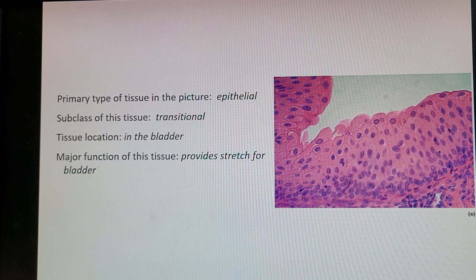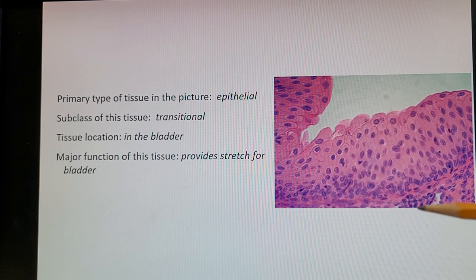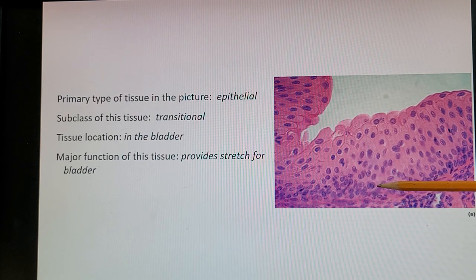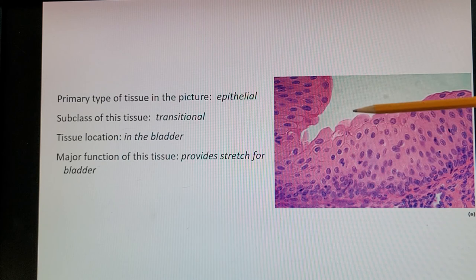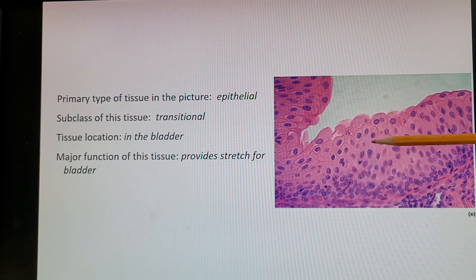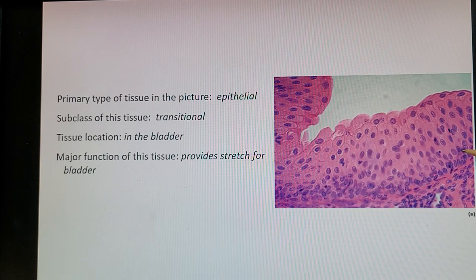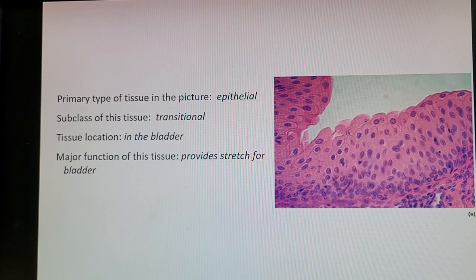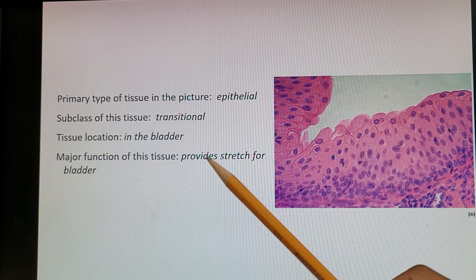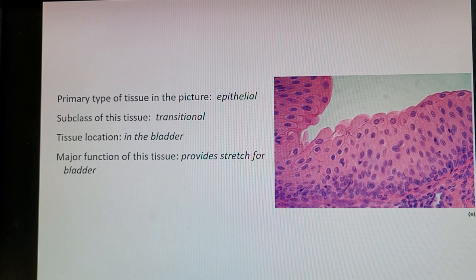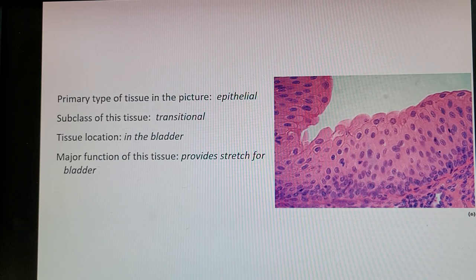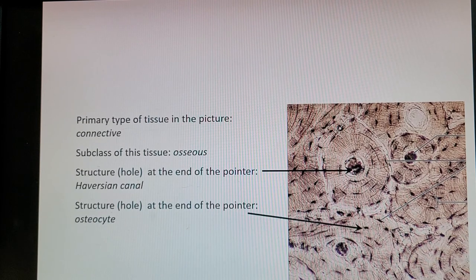Next is epithelial tissue — transitional. The basement membrane is visible, and it has multiple layers like stratified tissue, except that instead of cells becoming smaller toward the top layers, transitional tissue cells become larger in the upper layer. Nuclei are more packed together at the bottom and more spread out at the top. Those larger cells at the top provide stretch for the tissue. Location is the bladder and ureters — as the bladder fills with urine, the stretch allows it to hold more.